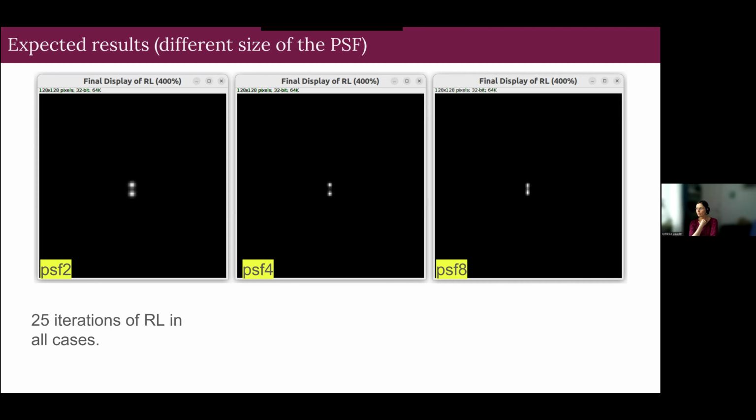I see. But in most cases, I work mostly with RNA and DNA FISH, and there we use the theoretical ones. So then I have the same question that I asked Hans then. Do you have any issues with people not putting their sample on the cover slip, putting it on the slide, and having a thick coat of mounting medium, and that distorts the PSF from one sample to the next in a different way? That is more than I know. I don't know. To be honest, I never used the microscope. Besides, of course, I wrote software for it.